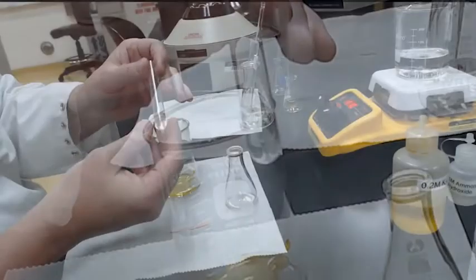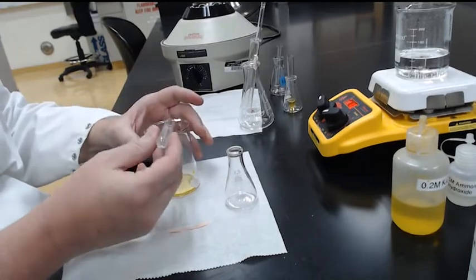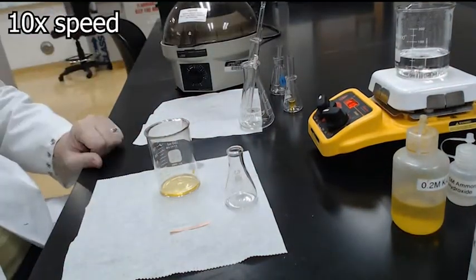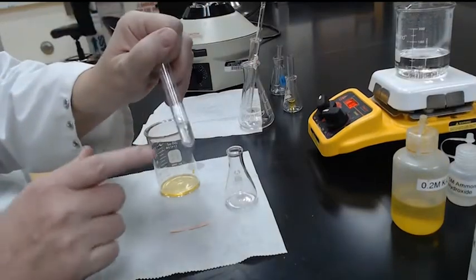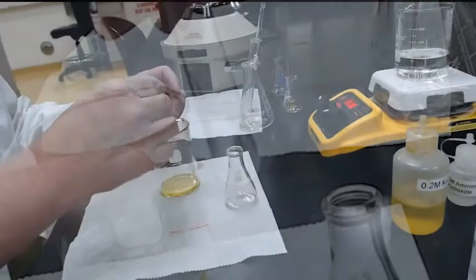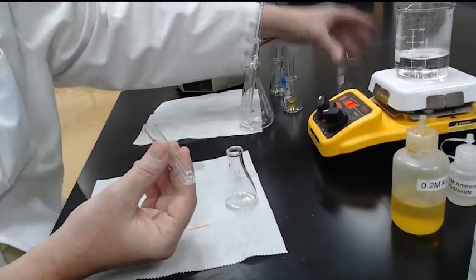We could go to the next stage, but the procedure says one more washing, so we will do one more washing just to make sure. Okay, for the last time, I would say our supernatant is completely colorless. We have our white solid on the bottom. We have now washed the precipitate and removed the chromium.